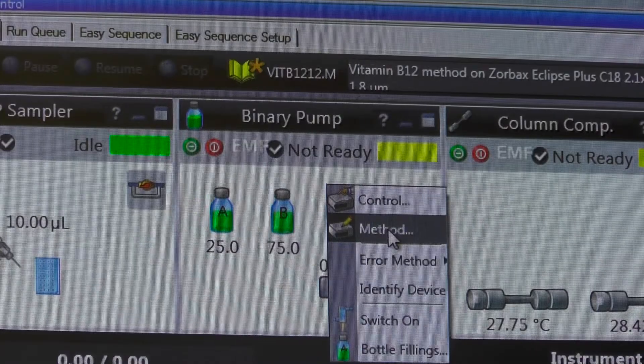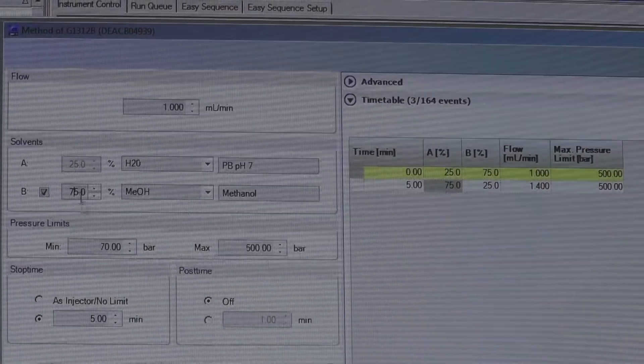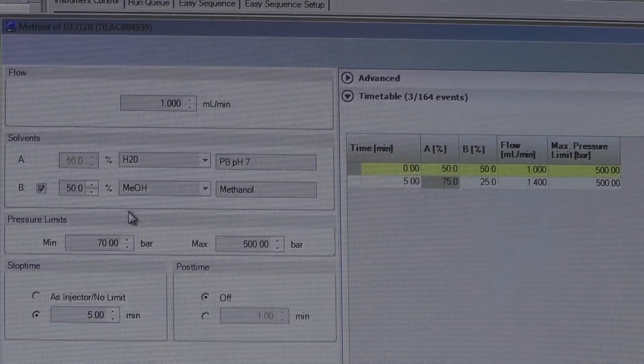Right-click on the binary pump icon and set the solvent gradient to 50% A and 50% B for degassing and click OK.